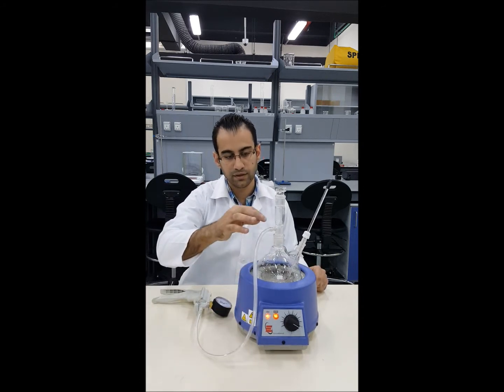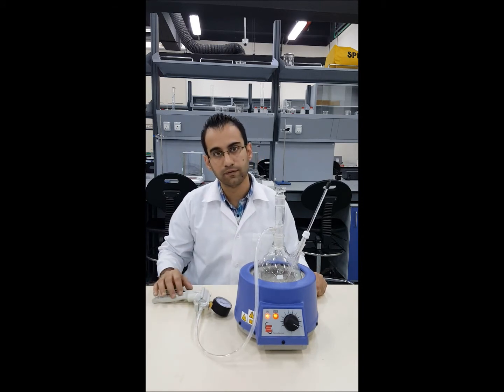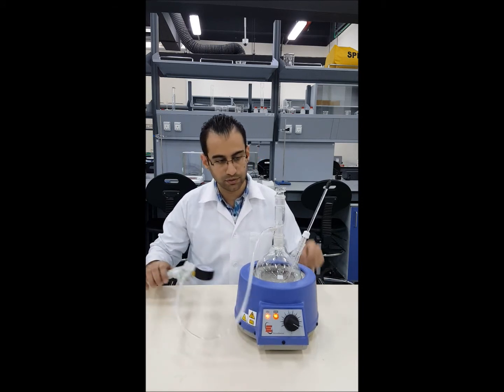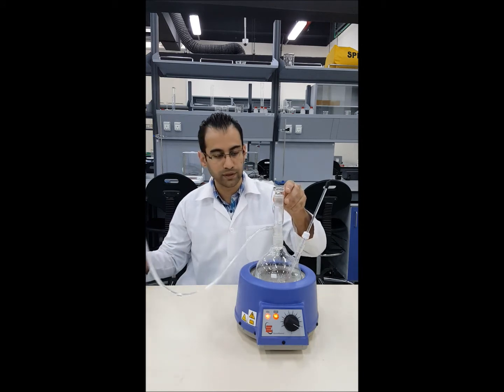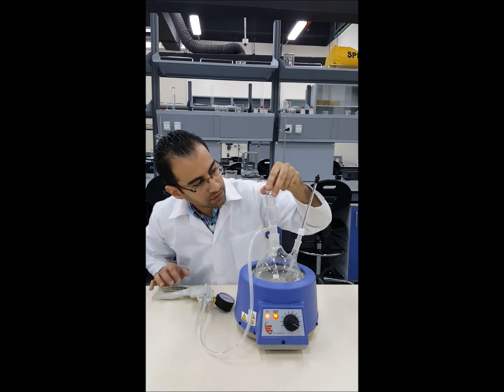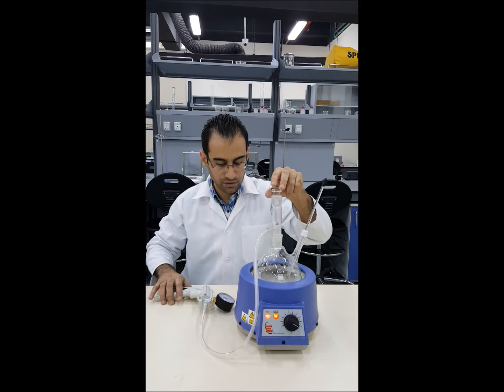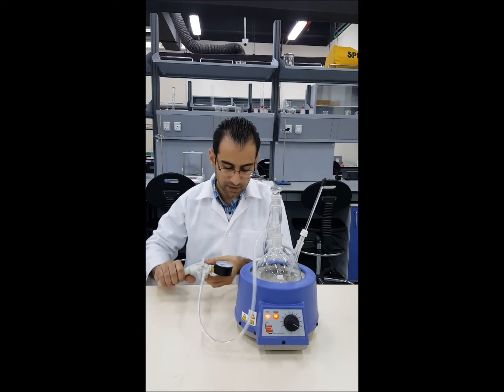Always be careful, as the pipe connecting the pump and the flask is short, so you don't want to pull it away as that might affect your setup. The temperature is rising — we've reached about 68 degrees.